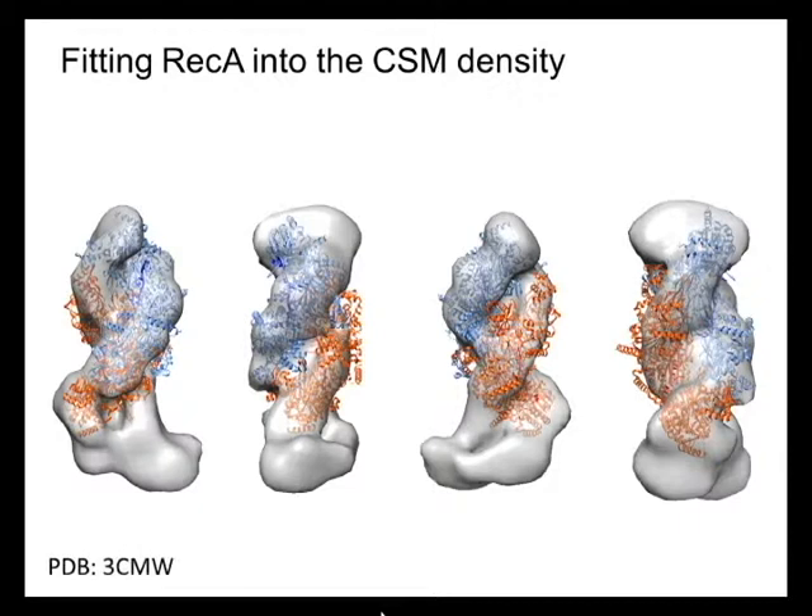You see that the two filaments are intertwined, though they are the same thickness — so that's a difference. But the pitch and the length of REC-A fit absolutely beautifully into the CSM structure.